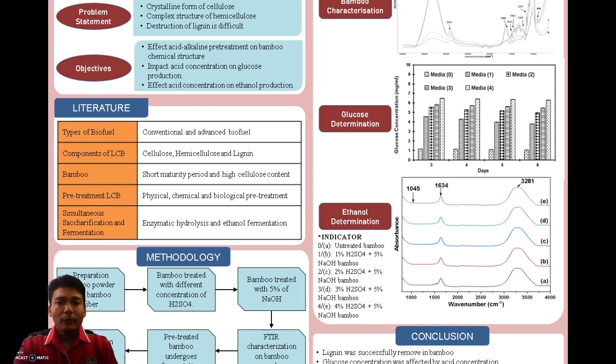The broad peak produced between 3400 to 3200 indicates the presence of a hydroxyl group in the sample. In addition, IR peaks formed between 1658 and 1638 show the presence of an alkene group with variable C double bond C bonds between atoms with moderate intensity.